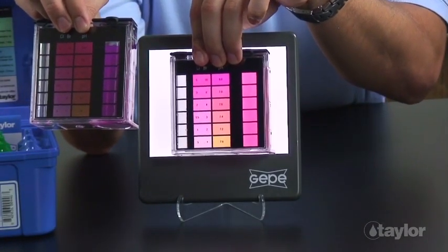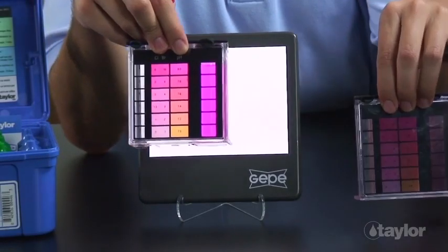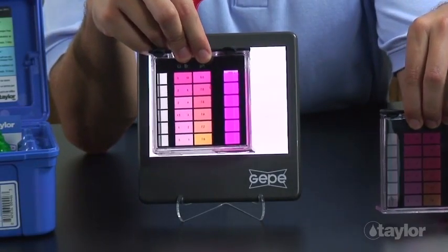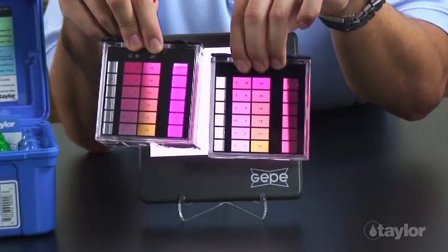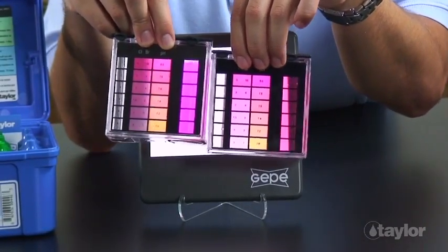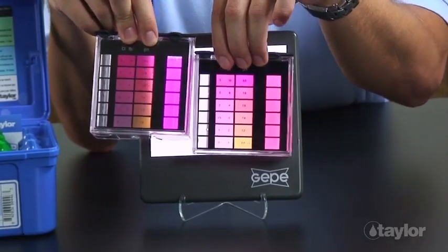Some pool operators will attempt to neutralize the high sanitizer first by adding a drop of sodium thiosulfate, reagent 7, before beginning the test procedure. However, this is not recommended since thiosulfate itself will alter the pH of the sample, leading to another type of inaccurate reading.